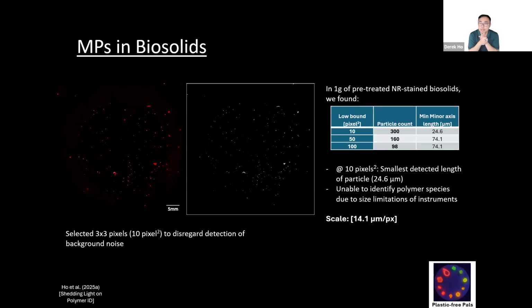However, this actually goes to show that FIMAP still has a little bit more work to do, because we need to do a lot of deep learning of environmental data in order to make this method more robust for environmental samples, especially at a smaller scale.